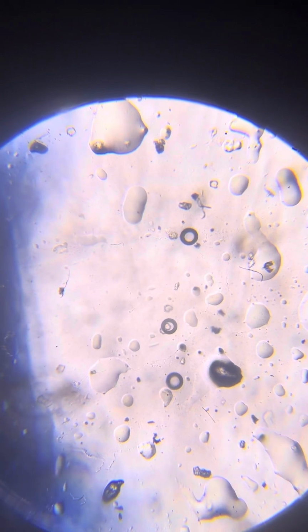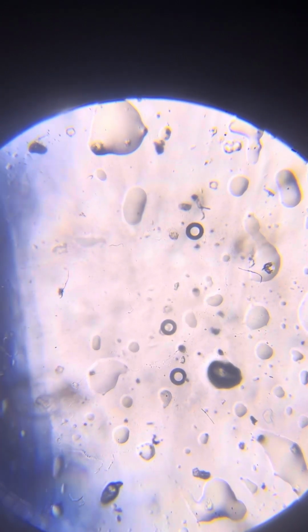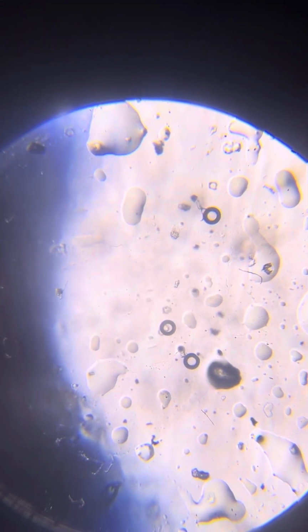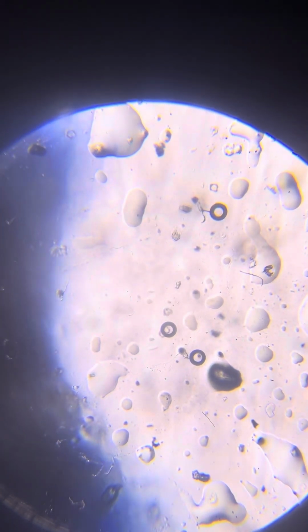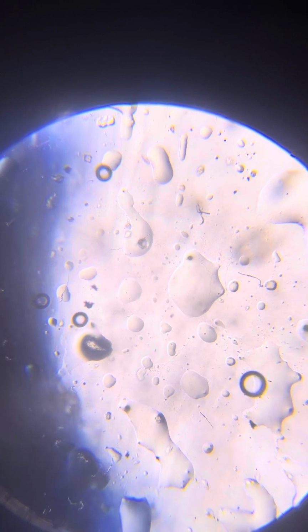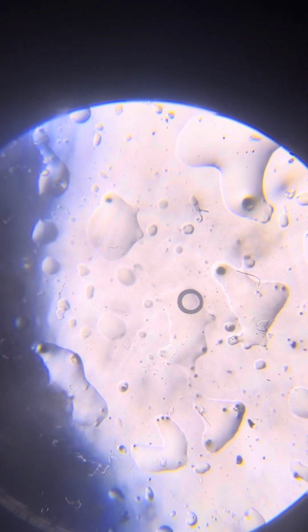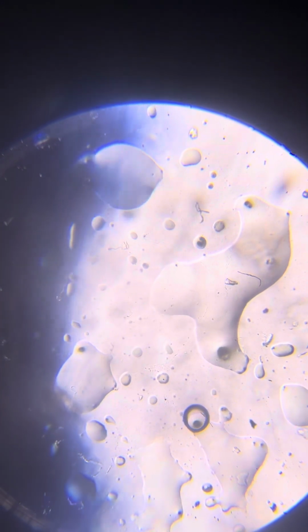Very nice. You see, other things are not moving. And they move not with the flow, but with kind of intention. Usually when you take stuff from a sample, you don't see them moving because you take them from their context, but maybe they created a new context here, I don't know.